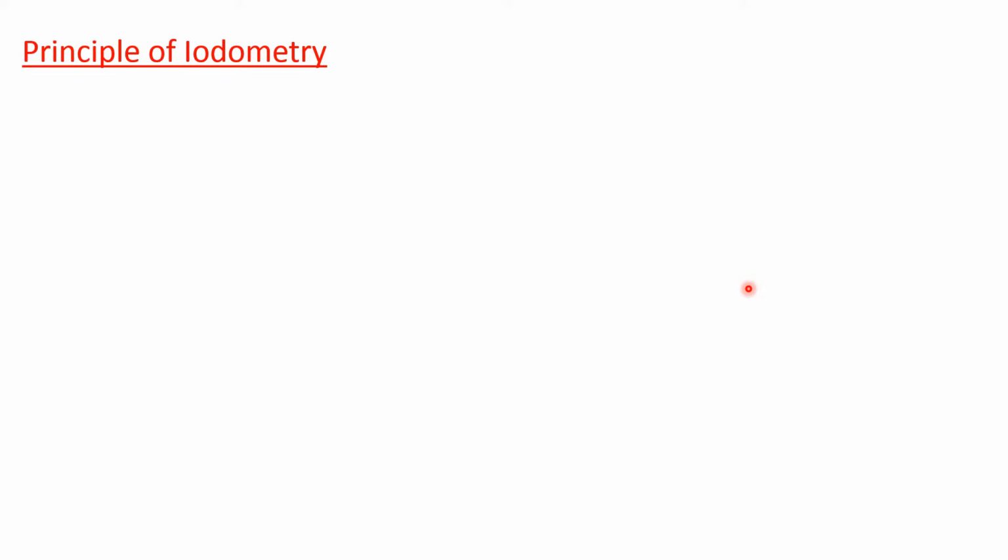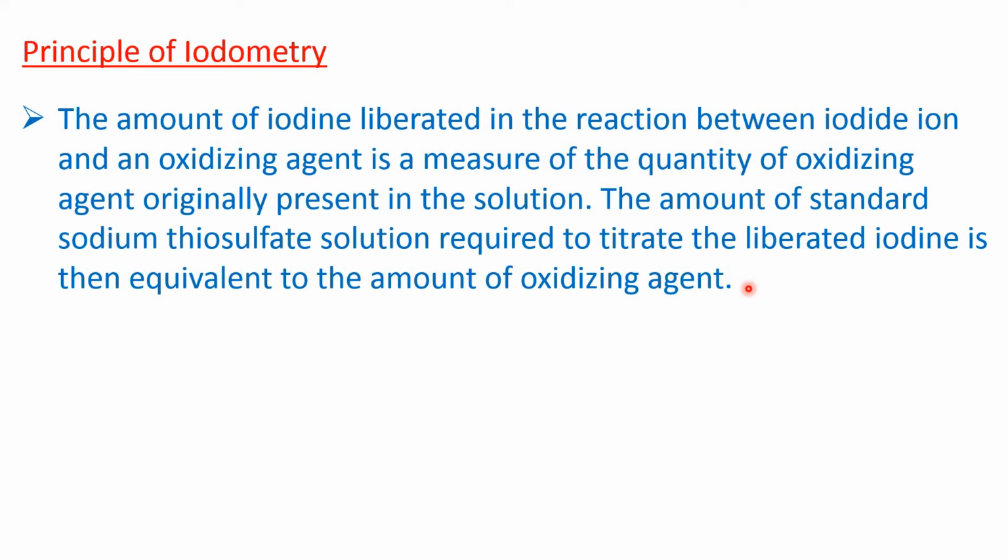Now coming to the principle of iodometry. The reaction between the iodide and the oxidizing agent, that means this redox reaction, is quantitative. That means the amount of iodine released by this reaction is the measure of the amount of the oxidizing agent present in the solution. And once again, the amount of sodium thiosulfate required to titrate this iodine is equivalent to the amount of this oxidizing agent.